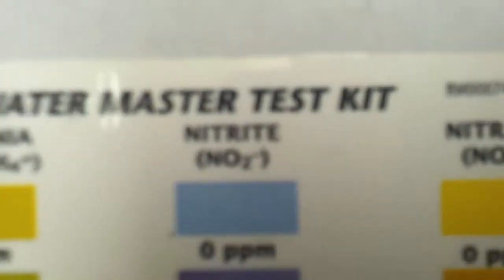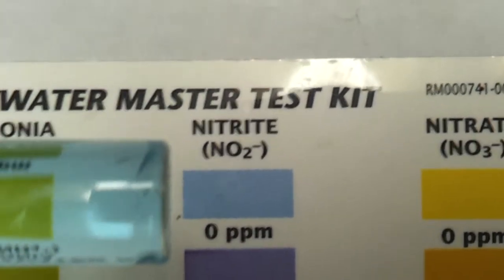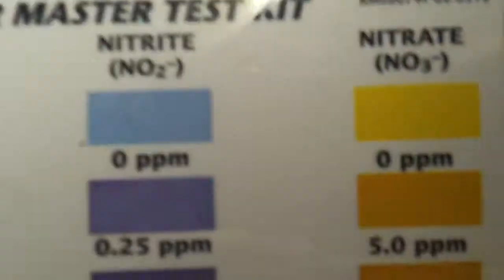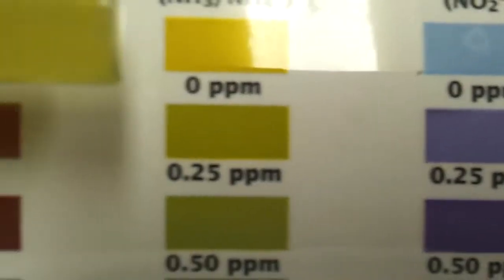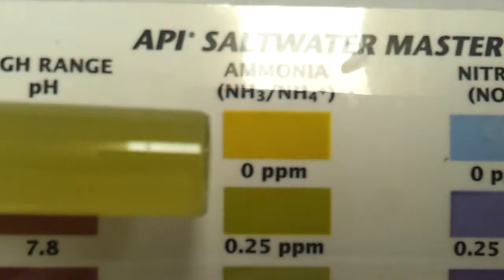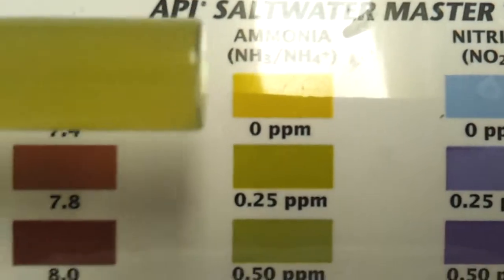Let's go with the nitrate — this is a little tougher than I thought it would be. Right here's the nitrate, and as you can see, nitrate is good.